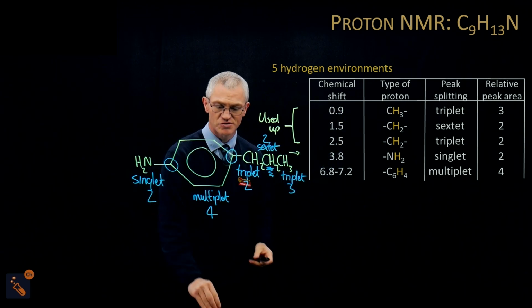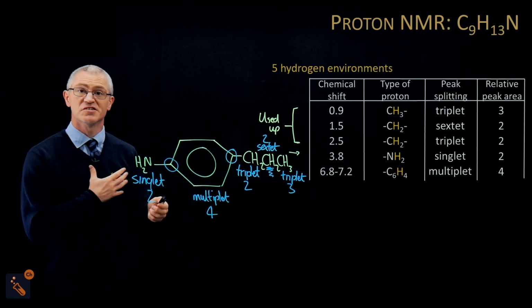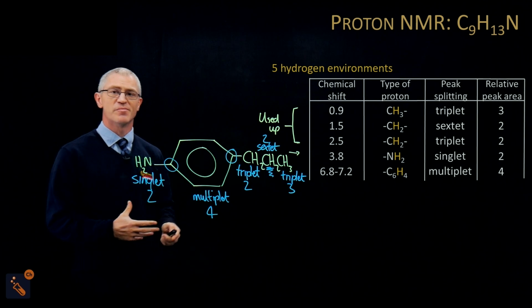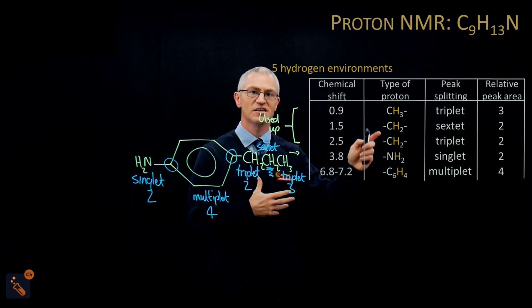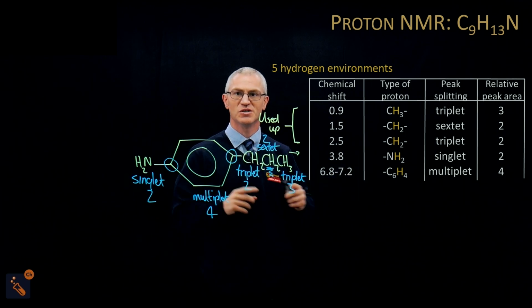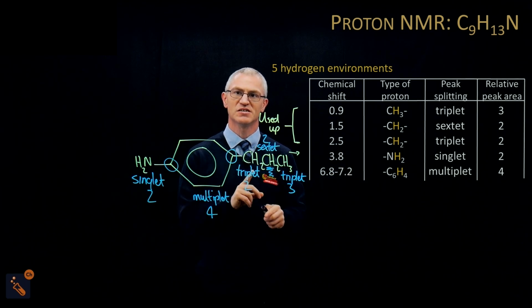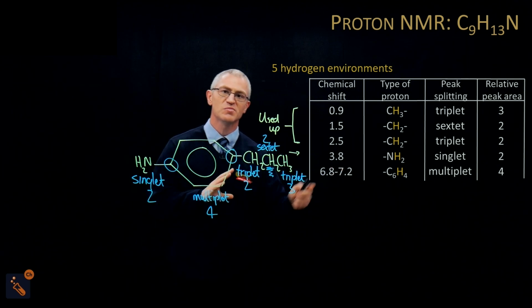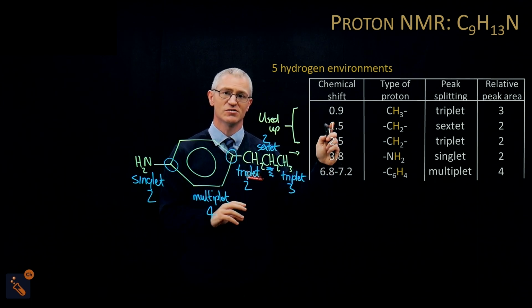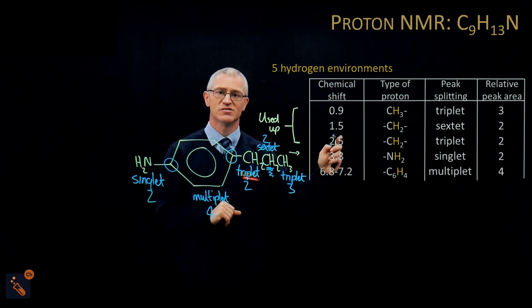So we're pretty sure that is the right answer. So the last thing to do though is you've got to make sure you get all the marks in the exam. And you'll notice here that the CH2s, it's not specific which CH2 you mean. Do you mean that CH2? Do you mean this CH2? So you have to be more precise. So all you have to do is take a chunk of the molecule out and put something next to it so you know exactly which CH2 you've got, and then highlight the H's that you want.